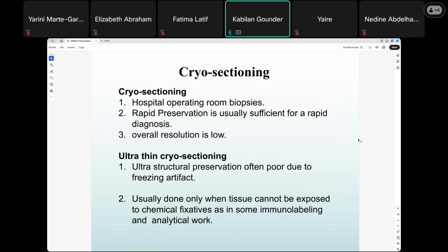The paraffin is wax. It is like a candle. At room temperature, it is a solid wax. When you heat it, it will melt. So we always use melted paraffin for our experiments, so that it will penetrate into the tissues. How we process all of them, we'll discuss next week.